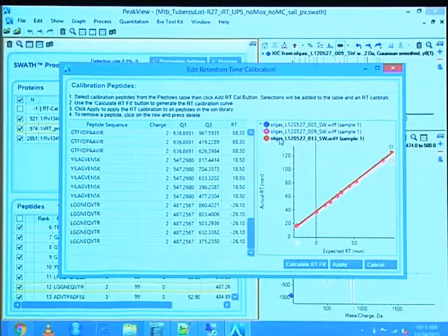This is all it does, by the way. It's just like, this is what it should have as a retention time, and this is what it actually measures. It takes an easy linear regression, and that's it. What you see now, going back to blue, is you have an issue, or up here you have quite a spread. Down here it deviates as well. But what I also have to say is in these kinds of regressions, the endpoints have quite a big effect on the entire thing. So we're going to have a look at them.